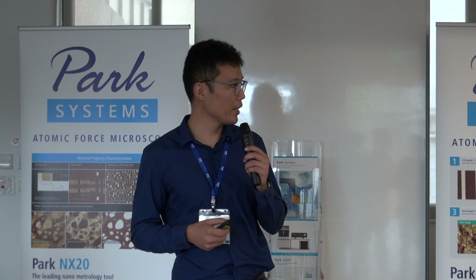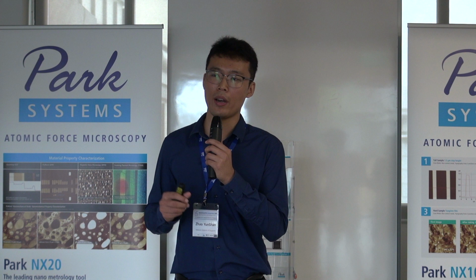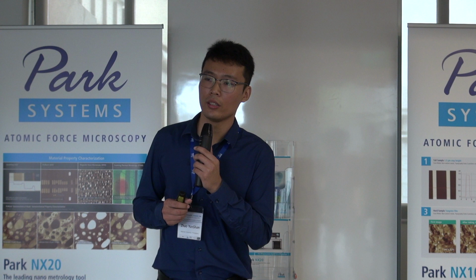The contact area, you mean the tip with your sample? Contact area. Because quantifying the Young's modulus is always limited by the contact conditions sometimes. So in my case the nanowire diameter is more than 300 nanometer. I think compared with the contact area it should be very large, right? Yeah, this diameter is of course larger than the radius of your tip. Yes. So if you want to quantify the Young's modulus, the final contact of your sample surface with your tip is very important.